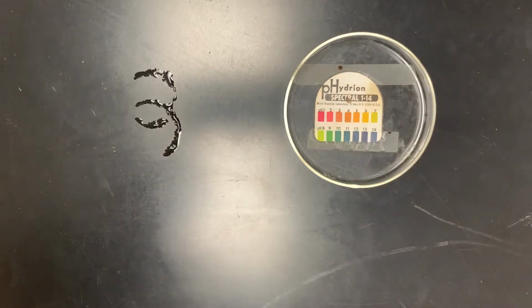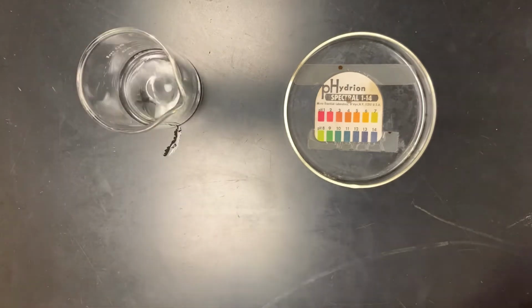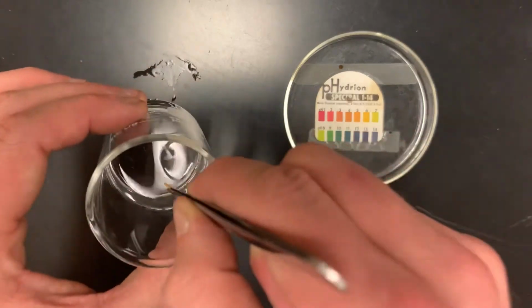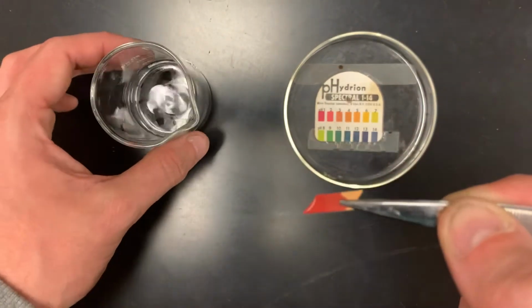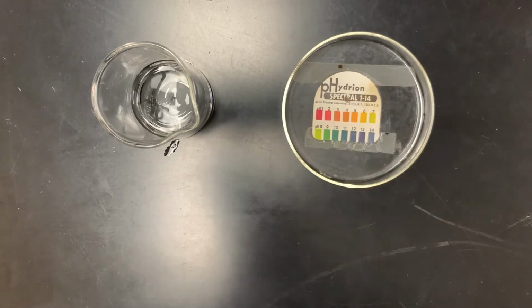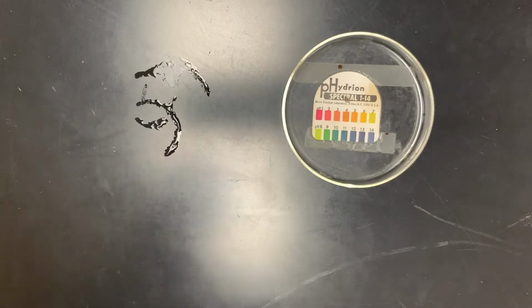We push on to aluminum nitrate, okay? So what we've done is we've exchanged chloride with our nitrate. So we still have aluminum, which may be a suggestion of what's going on here. Again, I identify that aluminum nitrate has a pH of about 2.